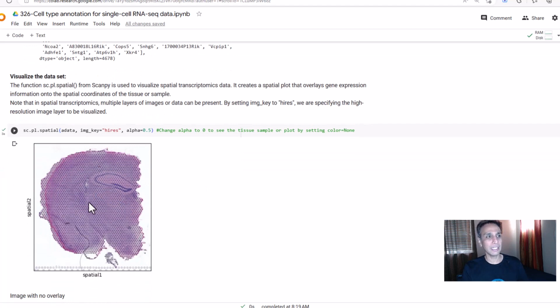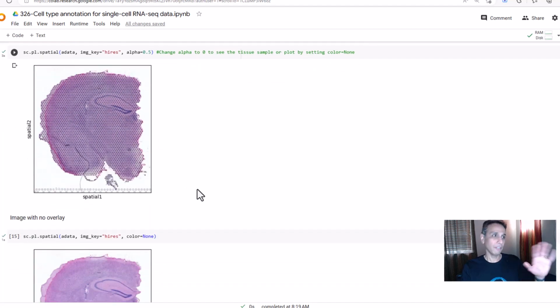But since you collected this with the spatial reference, I mean, transcriptomics with the spatial reference, you probably want to do something in association with the spatial location. So it makes sense for us to go ahead and visualize this. This is where all the data came from. And please note that for Visium, each data point right there is not a single cell. It's actually probably 3, 4, 5 cells, because this data point has certain dimensions and multiple cells may be under each spot right here. But still, it gives us a pretty nice idea about the spatial information from this tissue.